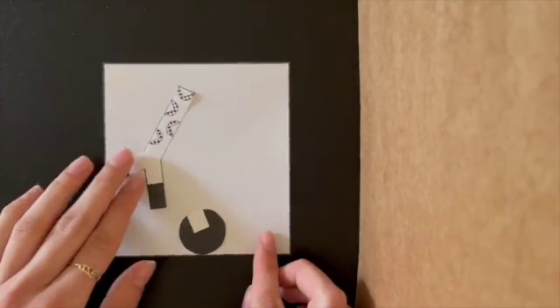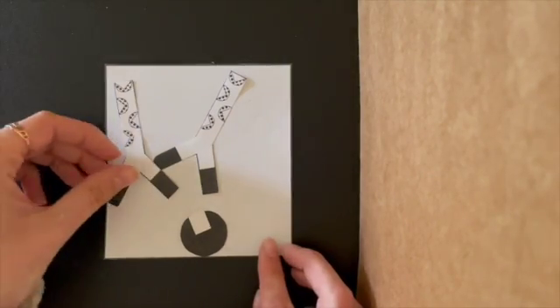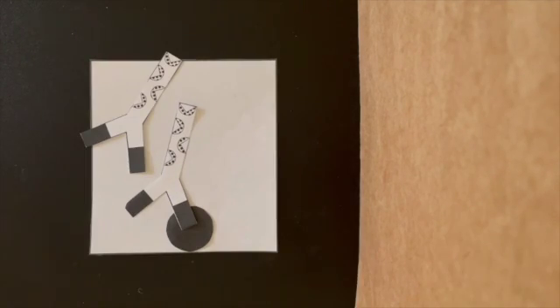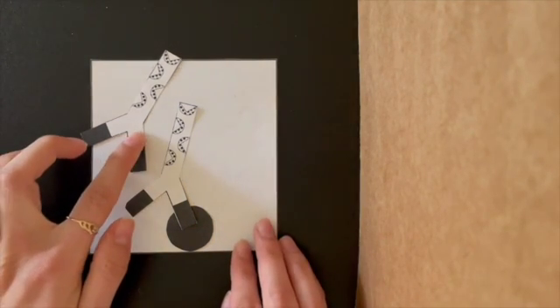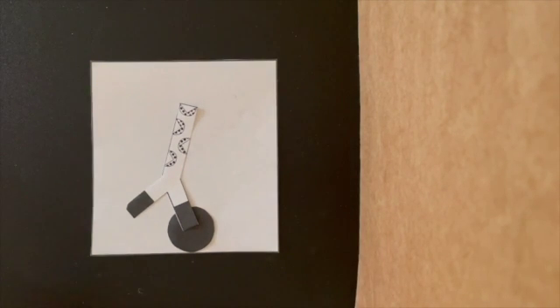Then the primary antibodies are added to the well, where the antibody interacts and binds to its specific antigen, the SARS-CoV-2 virus. The sample is then incubated for 5 minutes to ensure strength of antigen-antibody interaction. A wash buffer is additionally added to the well to rinse out any remaining primary antibodies that did not bind to the SARS-CoV-2 antigen. The wash buffer is added an additional time to purify the sample.